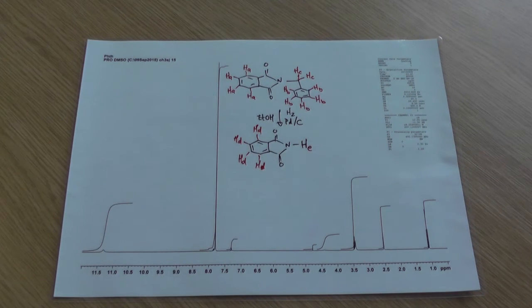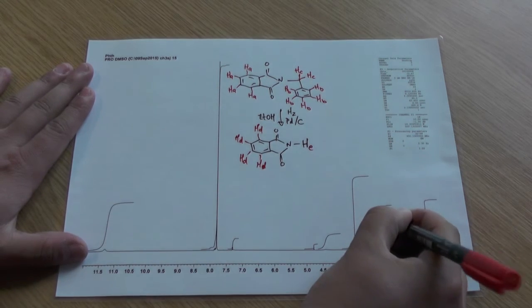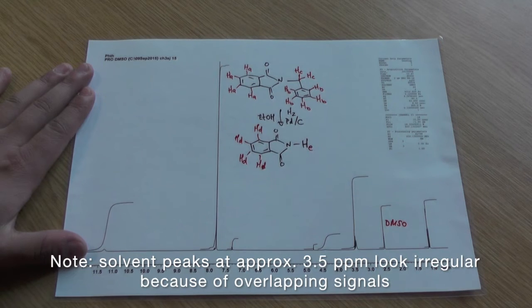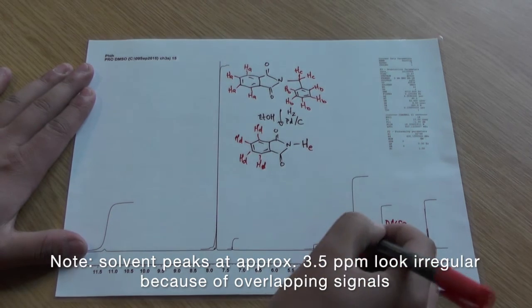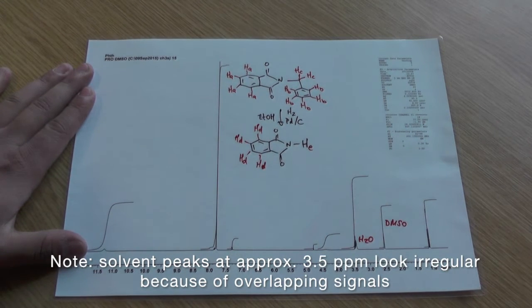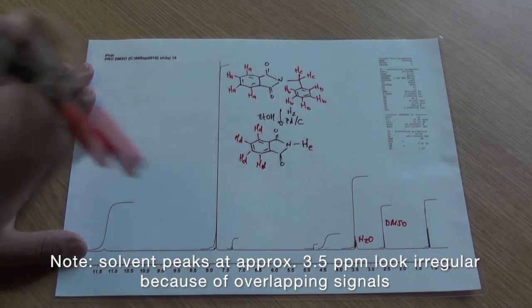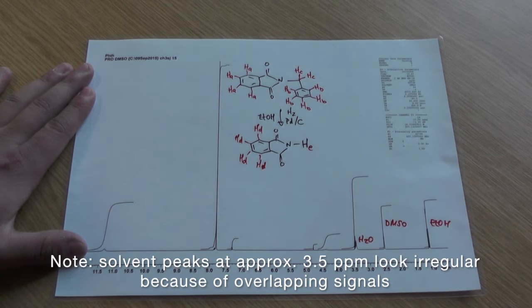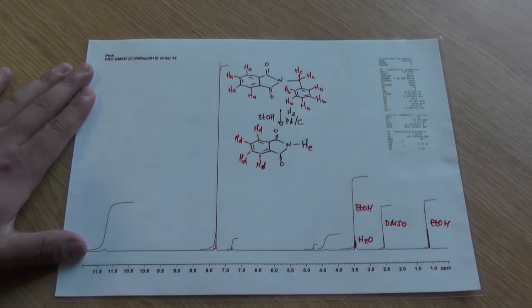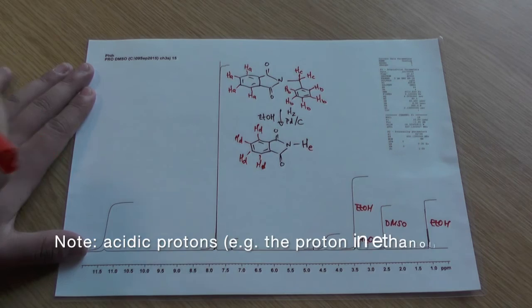Looking at our spectrum, we can rule out the peak corresponding to DMSO at 2.5, the peak corresponding to water around 3.3, and our three ethanol peaks: the first a triplet at around 1, a quartet around 3.4, and a singlet around 4.5.